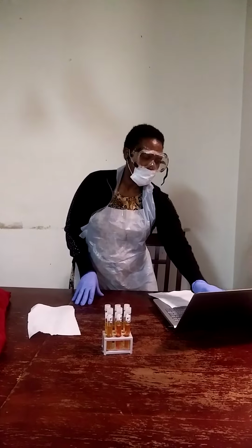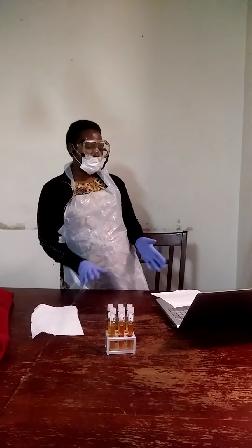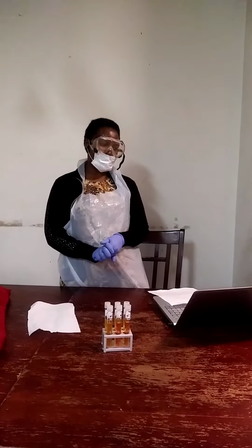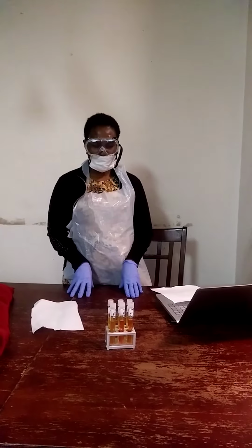Pertaining to biochemical testing for microbial identification, carbohydrate fermentation testing, which I've already done.